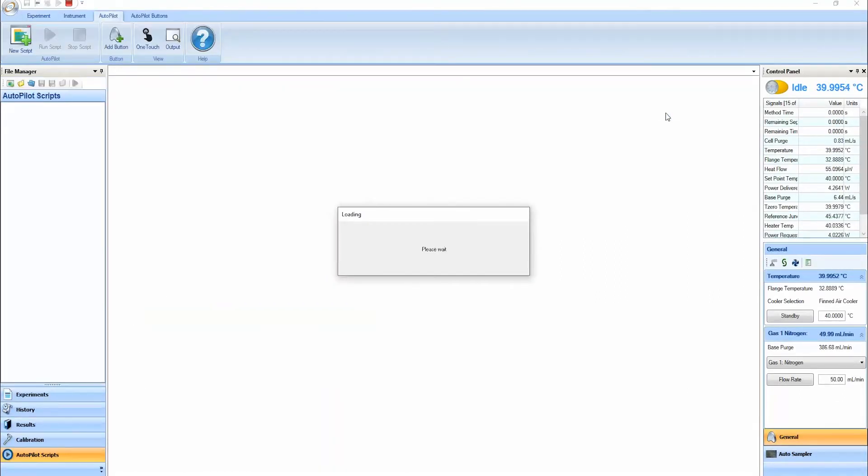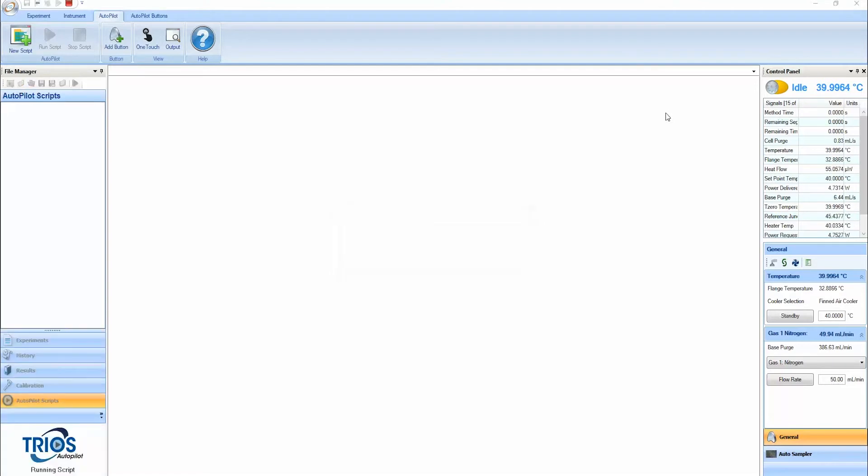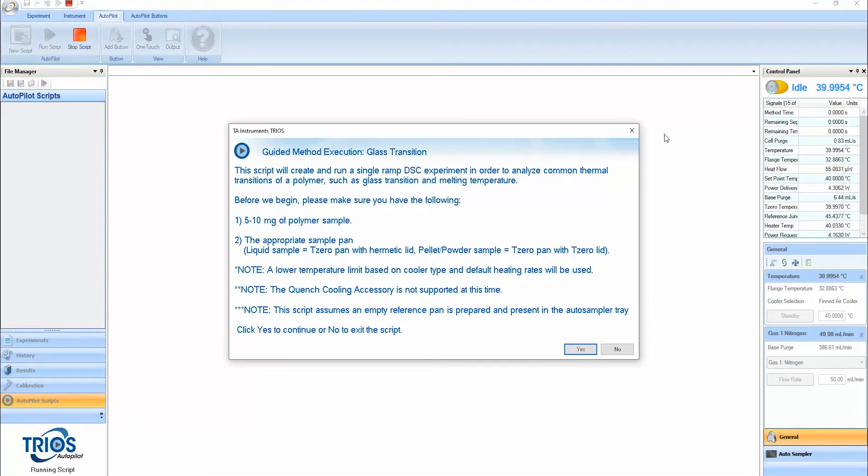With guided methods, Trios provides a simplified user interface and an instructional framework to reduce training time, reduce mistakes, and reduce user-to-user variability.